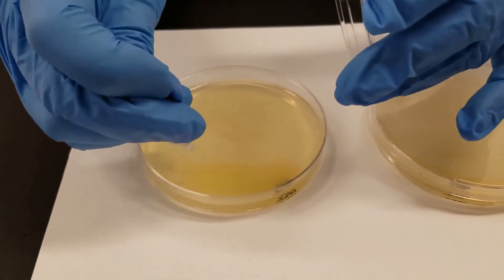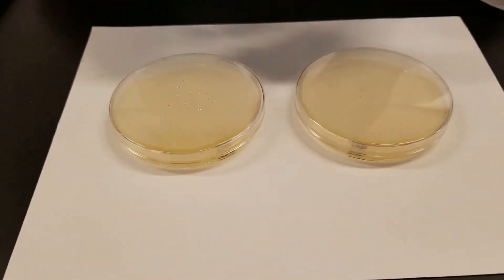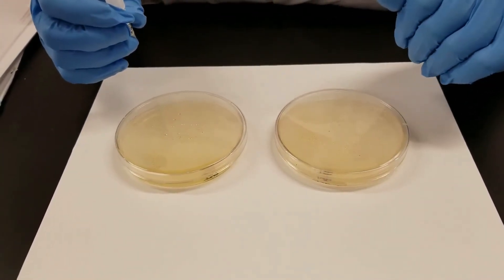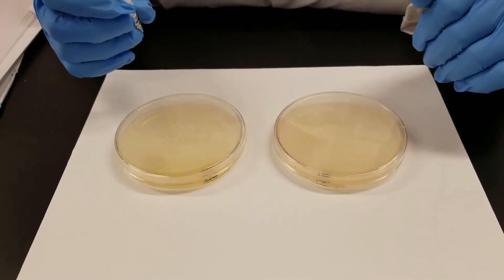Let it sit. You need to let it sit sometimes up to about five minutes for a color change. If there is a bluish color, that is positive. If there is no color change, that is negative for the oxidase production.